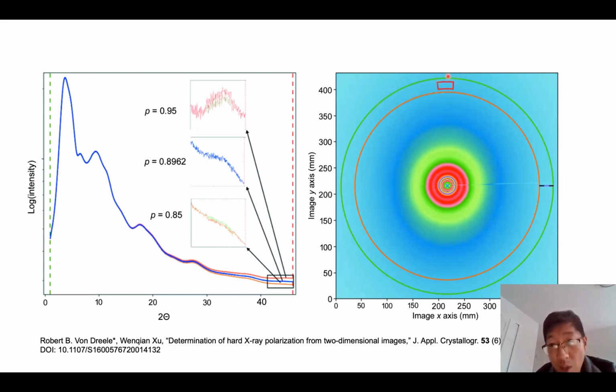If you mask out some areas, as you sometimes have to, for shadows from sample chambers or unwanted scattering features, you mask them out. As your integration crosses the mask boundary, your integration actually will normalize the data when reaching the mask, because it has different azimuth coverage.